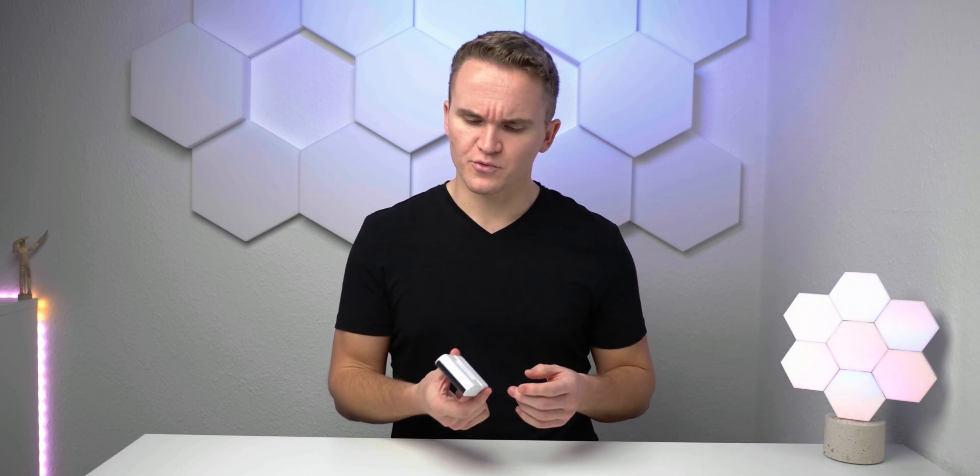I would love to have something like a tripod thread or something like this on the bottom, the quarter inch thread. So I can mount it somewhere like on a desktop based tripod or on a bigger tripod and put all the things down here because now it's just flying around a little bit. So this could be improved in the future. But besides this, this is really a good product and I really like the idea and the approach of it.